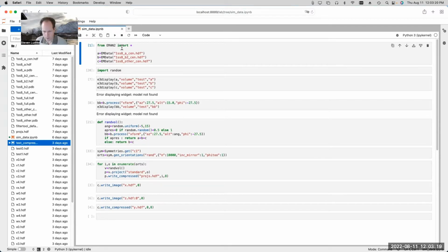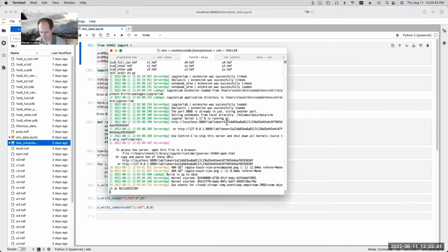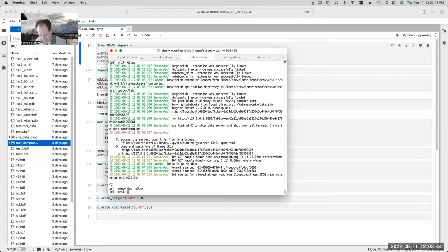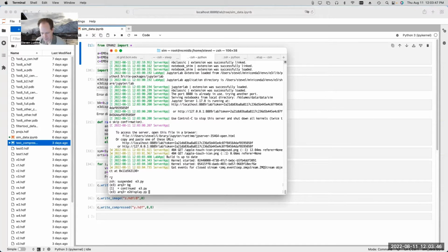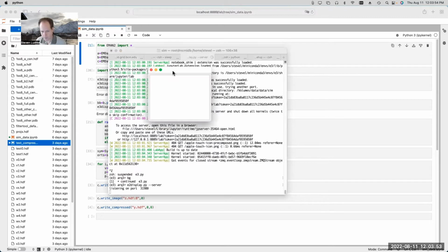Right, so we were reading from an HDF file, which we had made from a PDB file at the command line. I did a little bit of a display test there. I guess I should probably open that display widget on my own machine again. I've got a bunch of other windows covering stuff up that you can't see, so if I seem to be navigating over nothing, that's what's going on.